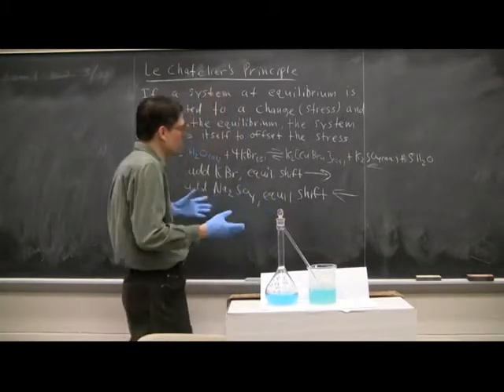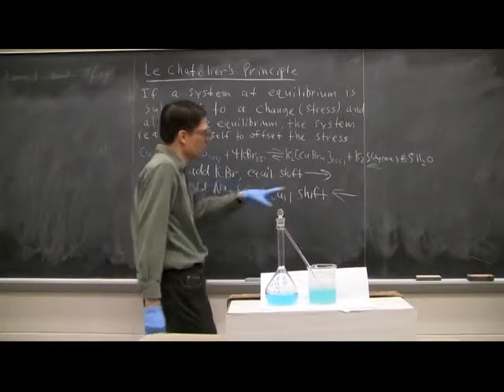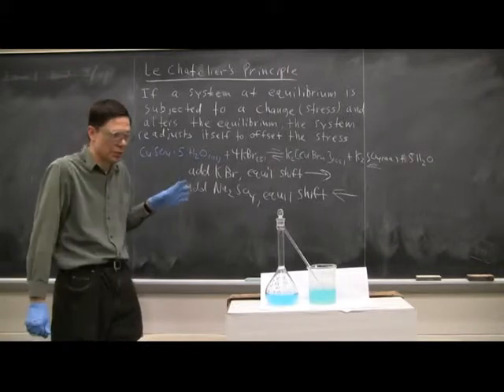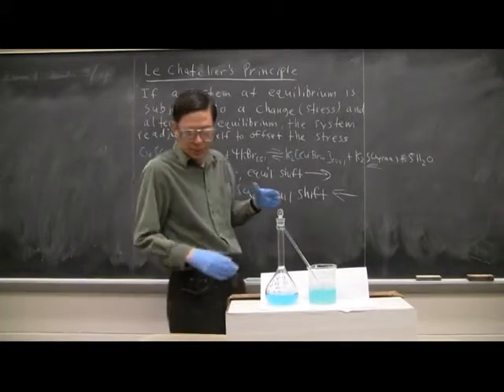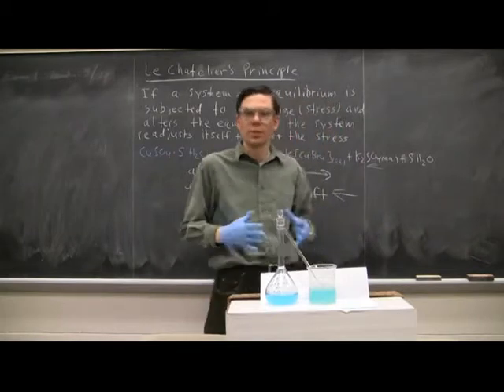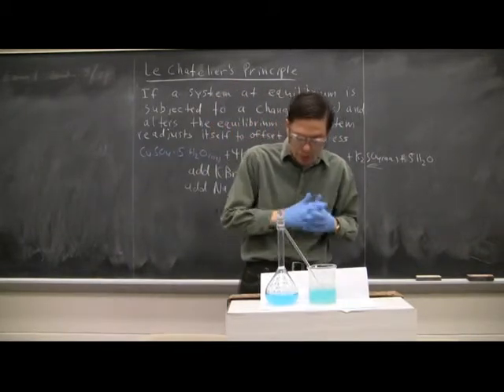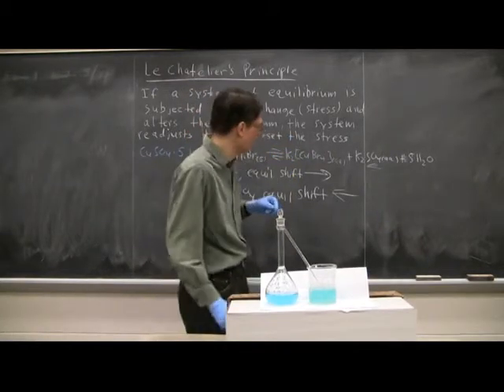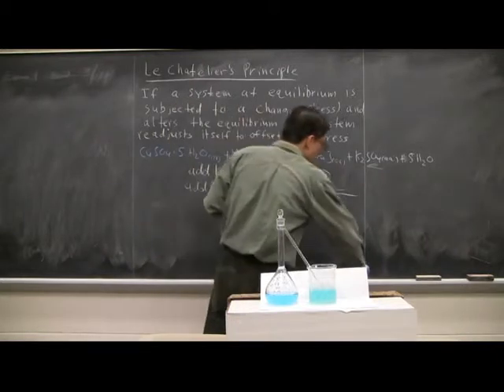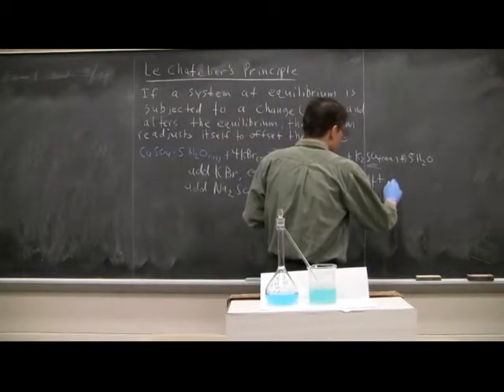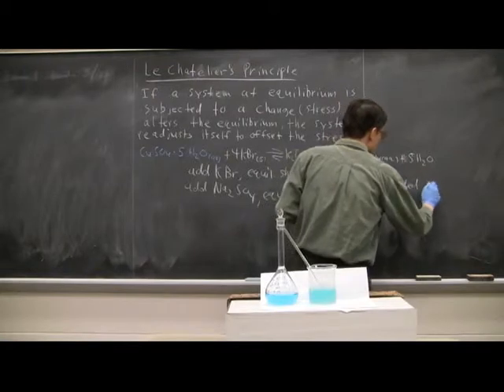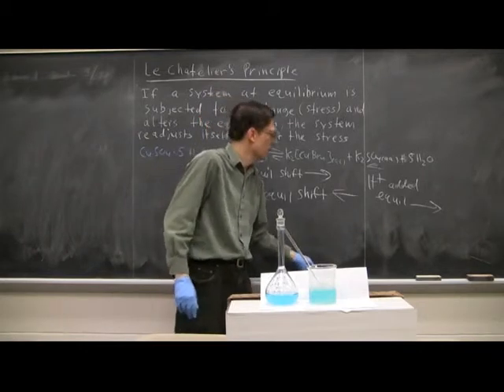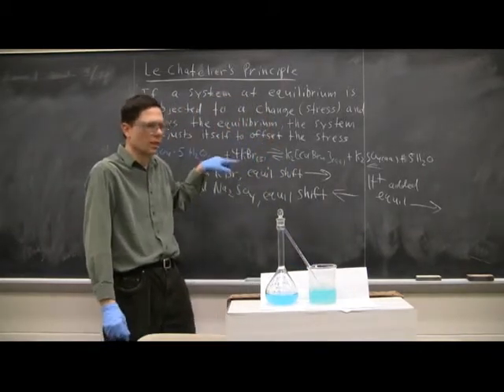Now something else that can be done here: when you add a basic solution, more or less like we have here, potassium sulfate, we can add an acid and we could change the equilibrium. By adding, let's say, some hydrochloric acid, we're increasing the H plus concentration and the acidity. So what will happen is, if we add some H plus, well then the equilibrium will shift that direction. At least it should. Because we kind of have a basic solution now. So let's see what happens.